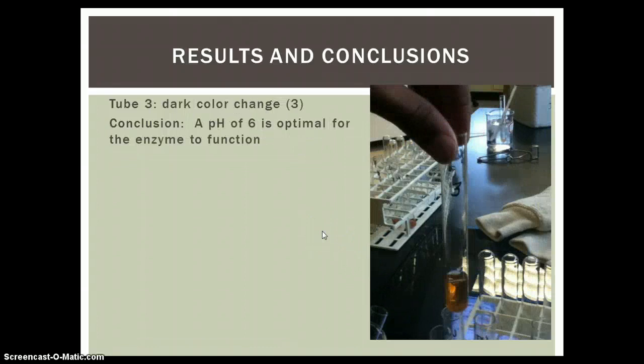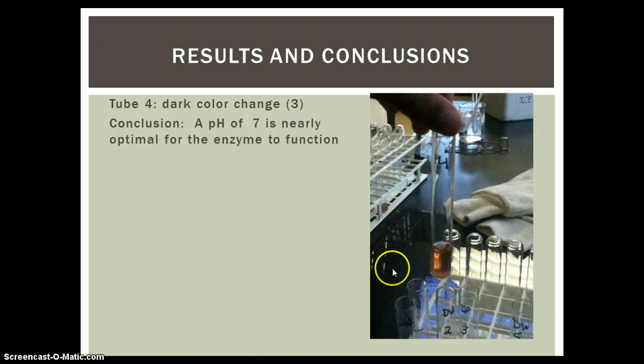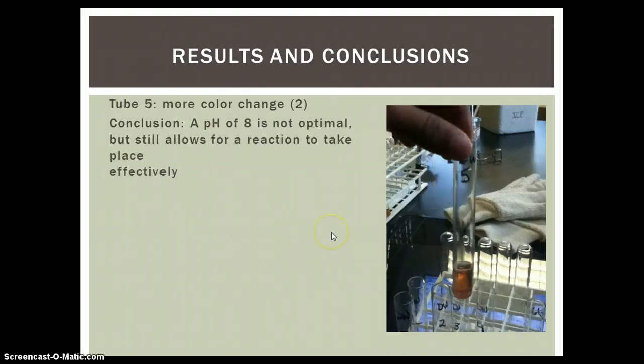Results, tube 3, there's a dark color change, 3. And our conclusion is that a pH of 6 is optimal for the enzyme to function since it was the darkest. You can see here all the brown that showed up in tube 3. In tube 4 there was a dark color change, another 3, and our conclusion was that a pH of 7 is nearly optimal for the enzyme to function. Not completely optimal, because as you can see it's not as brown as the other picture, but it's still a 3 on a scale of 0 to 3, so it's still a pretty good turnout for the enzyme.